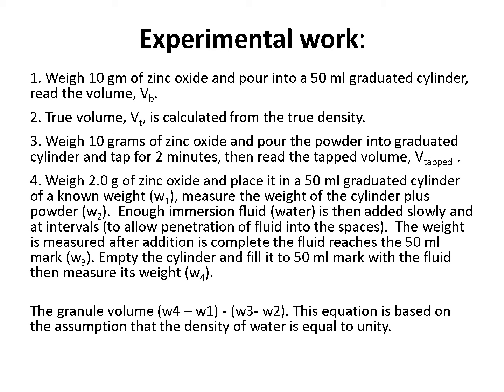It will be near 50, because the density of water, so if we have 50 ml this number will be close to 50, not exactly 50 but close.